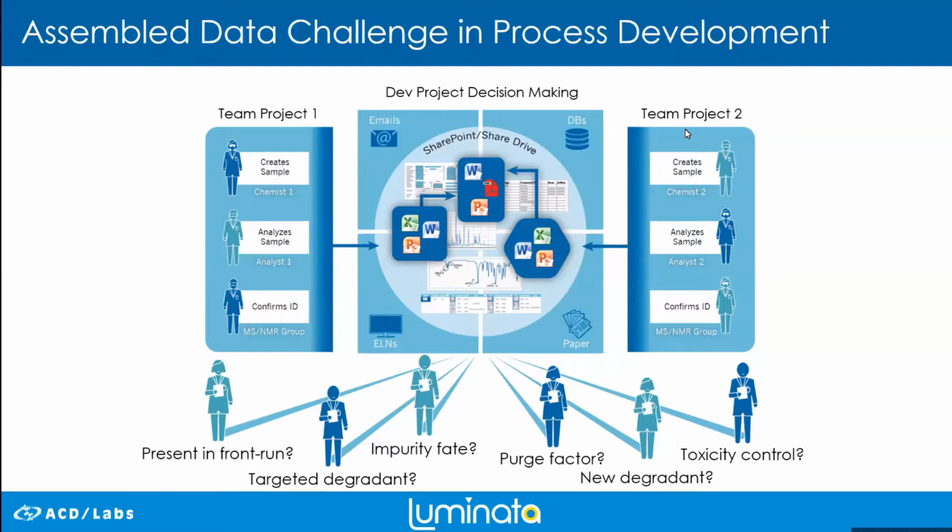The big consensus is that even in the same team, in the same projects, multiple stakeholders are doing this maybe very differently. Some people may be putting it as a PDF in their ELN. Maybe, again, it's placed into Excel, which is a static page inside of SharePoint, internal databases, or emails. So really, that's what we're going to cover today and see if we can streamline these results.